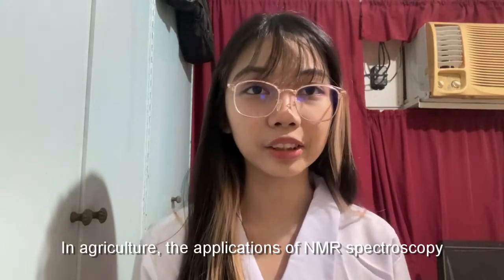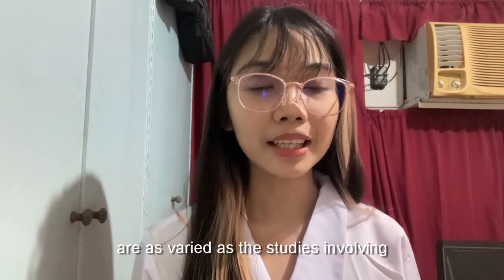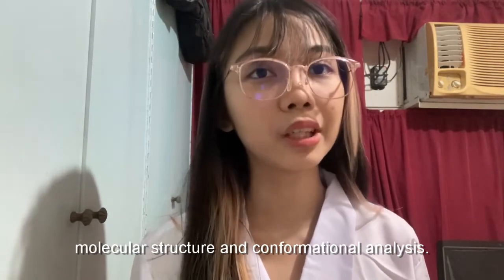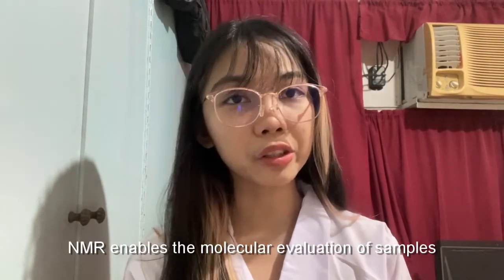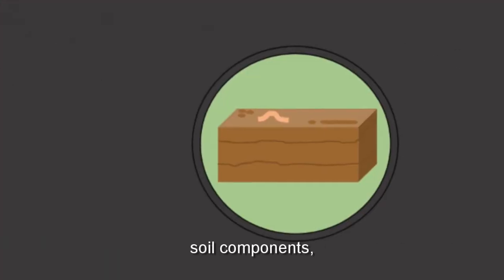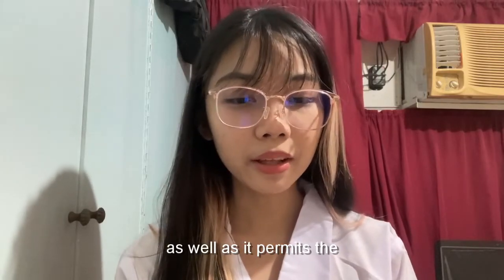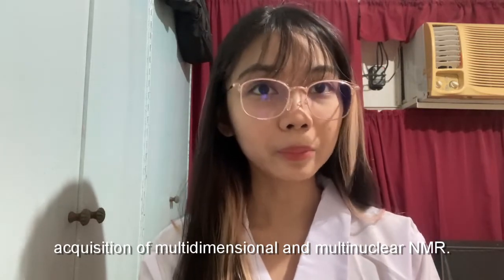In agriculture, the applications of NMR spectroscopy are as varied as the studies involving molecular structure and conformational analysis. NMR enables the molecular evaluation of samples in a semi-solid state of agricultural concern, such as plant tissues, soil components, vegetables, and agri-food products, as well as permitting the acquisition of multidimensional and multinuclear NMR.